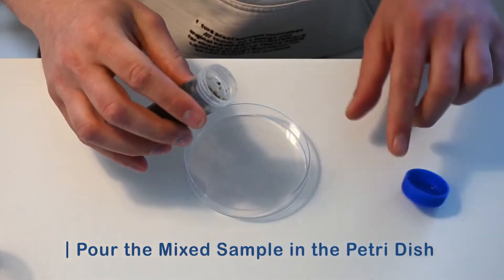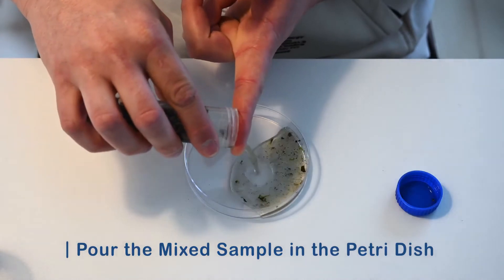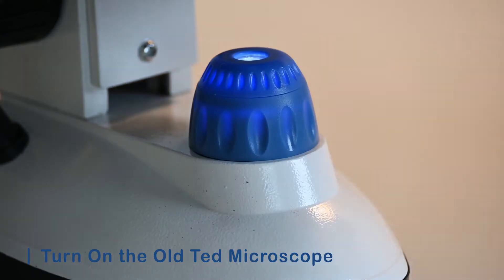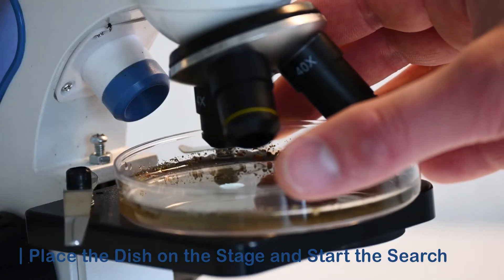Pour the water into the petri dish, but try to hold back as much debris as possible for a clearer view. Now we turn on the microscope and search through the water using the lowest magnification.